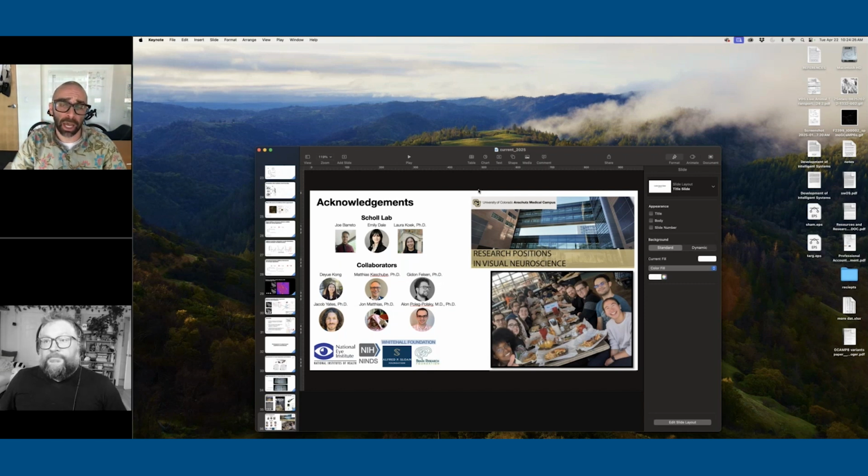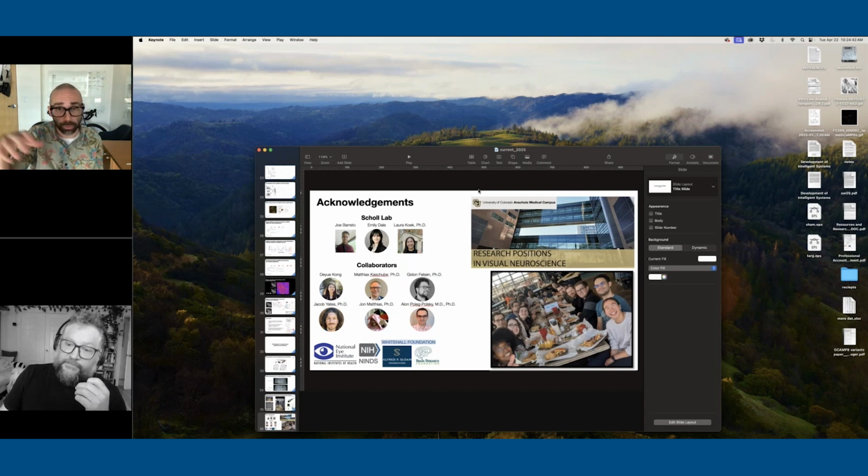Not too much. Most of them have a long tail of absorption, so we're not changing the wavelength too much. If you're using a Monaco, it's set. We are playing a little bit of games where we do stretch the Z profile of the optogenetic stimulation as well, because we want to spread that laser power over the neuron. We just do that by adding some glass or something, but you can do it by shaping on the SLM path too. The main thing is that the larger the pore, the more sensitive the cell is to photoactivation.